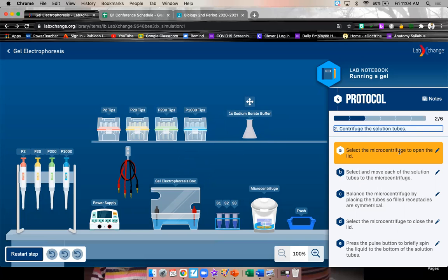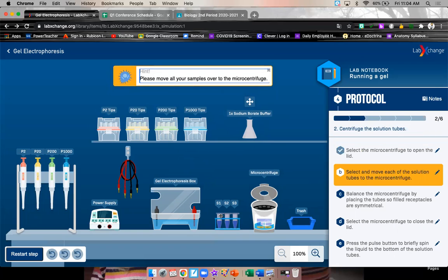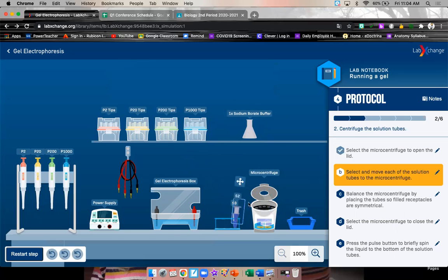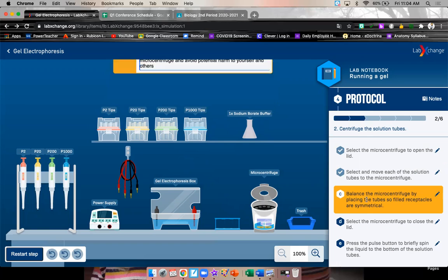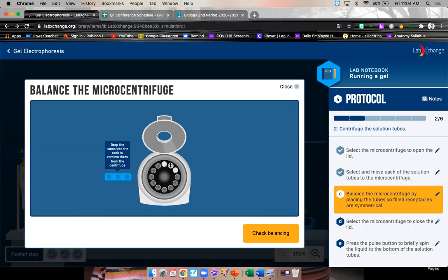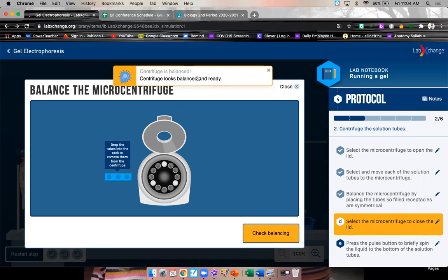Next, select the centrifuge to open the lid. Here's our centrifuge. Click on it to open it up. And we want to move our samples one by one into the centrifuge. This is going to spin it around really fast. Balance the microcentrifuge by placing the tubes so filled receptacles are symmetrical. That means we want to spread them evenly. So move it so you have three empty spaces in between each one. And check balancing. Centrifuge looks balanced and ready.